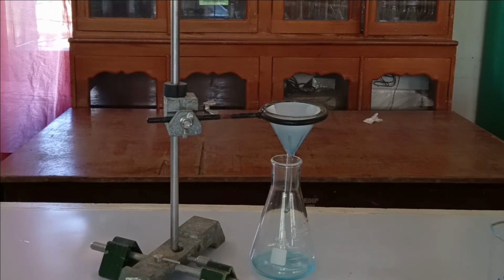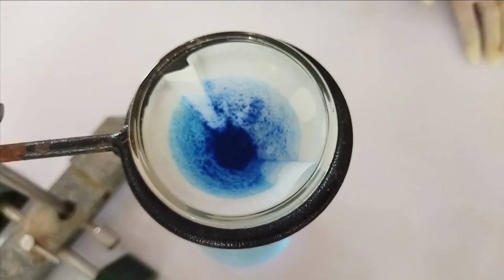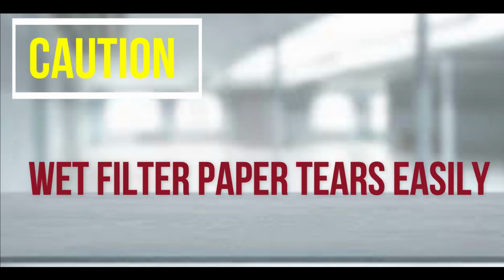If the precipitate needs to be washed, the washing is most efficiently done while the solid is still in the beaker. The major transfer is done with the last wash. If the solid is to be saved, remove the filter paper carefully and place it on a watch glass to dry. Remember to be cautious because wet filter paper tears easily.